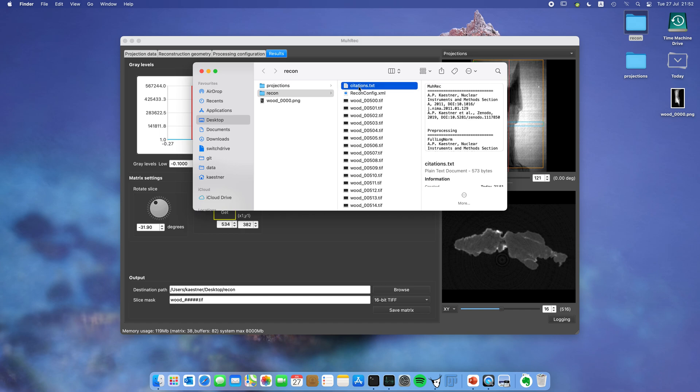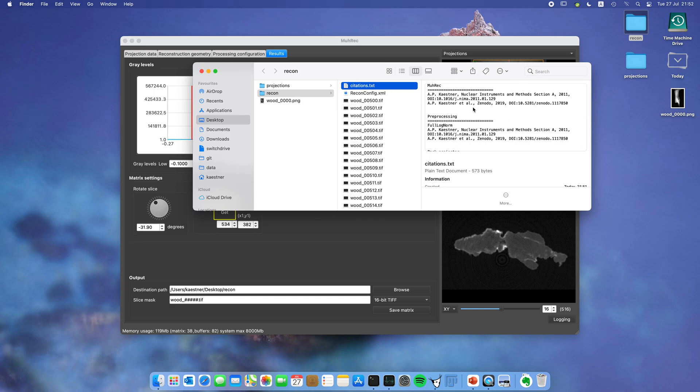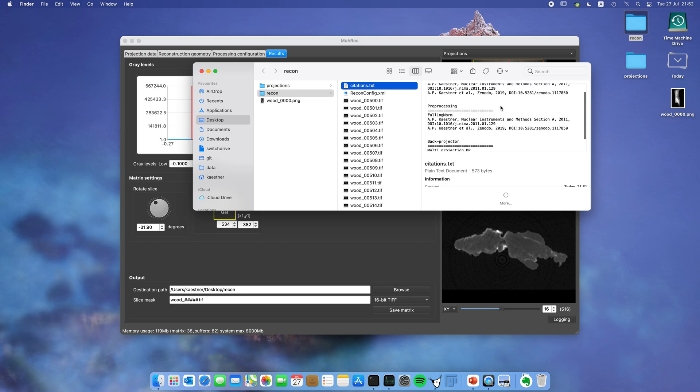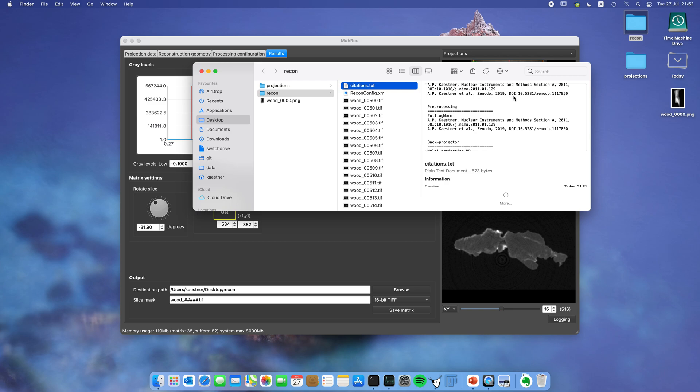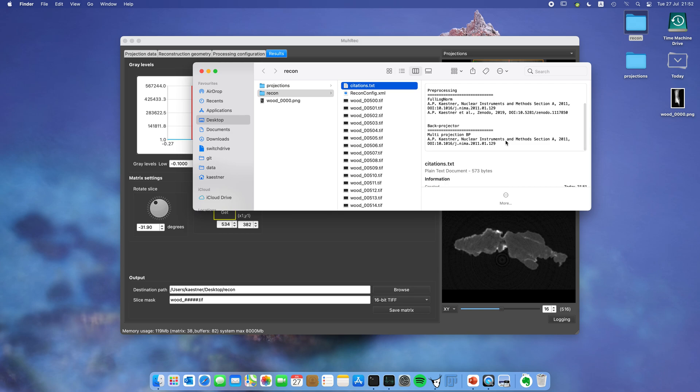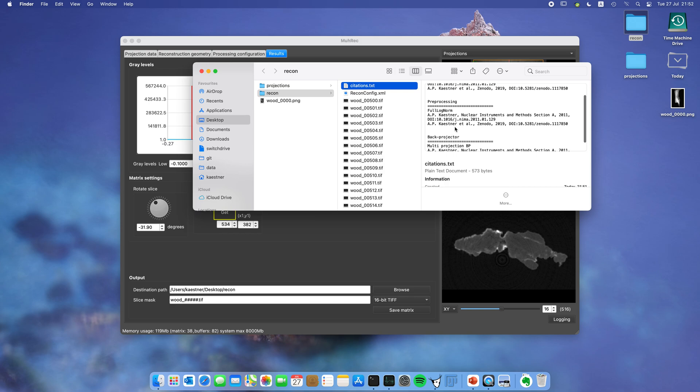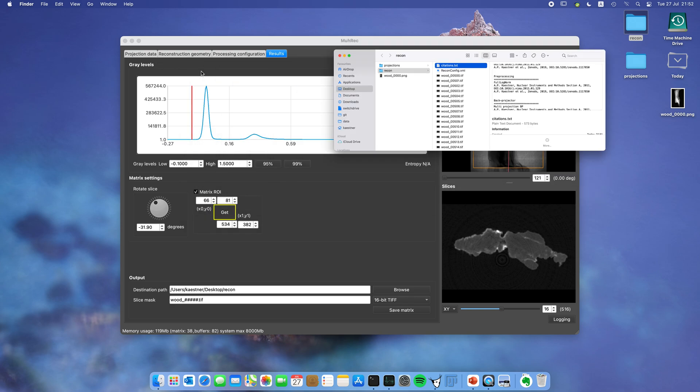Another file which is very useful is the citations. It tells you which publications to cite when you do this reconstruction. In this case it's mainly the software paper. You can tell here which version of the reconstruction you've been using, and also here you can see the back projector which has been used. When you add more pre-processing algorithms, these will also be added in this list.